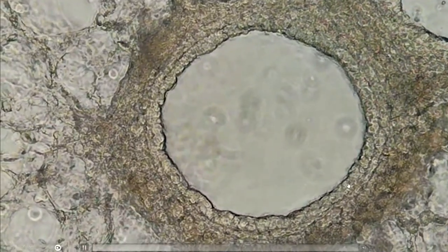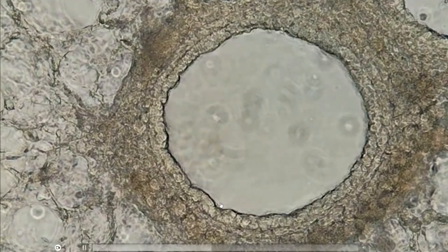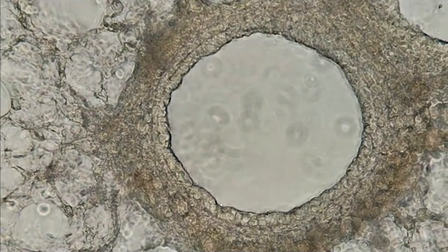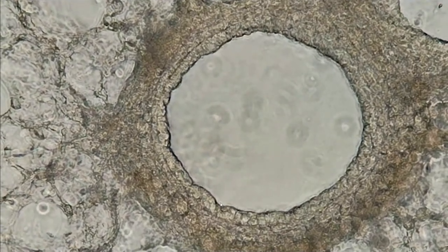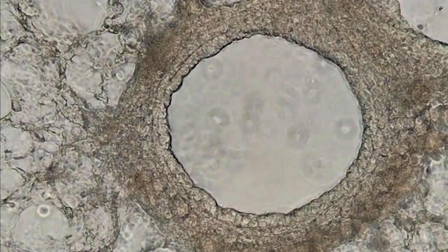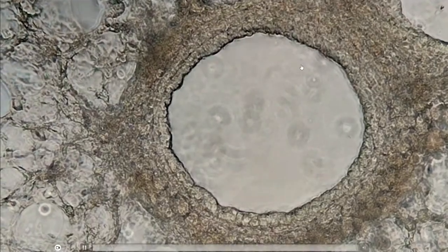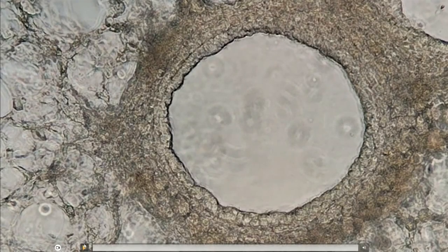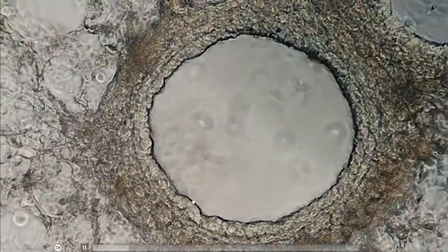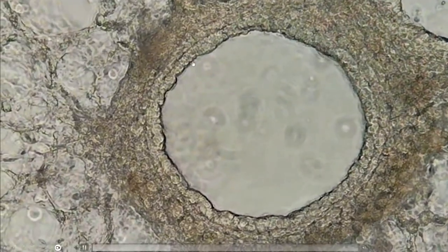And this just gives you, so here's your smooth muscle ring. And the cilia beating is indicative of the viability of the slice itself. It tells you that you have a healthy slice, and it usually will show up after days of culture. So once you've generated your slices, and they are in culture for some days, the cilia will rebuild, and they may be active and beating, which is indicative, as I said, of a very healthy slice.